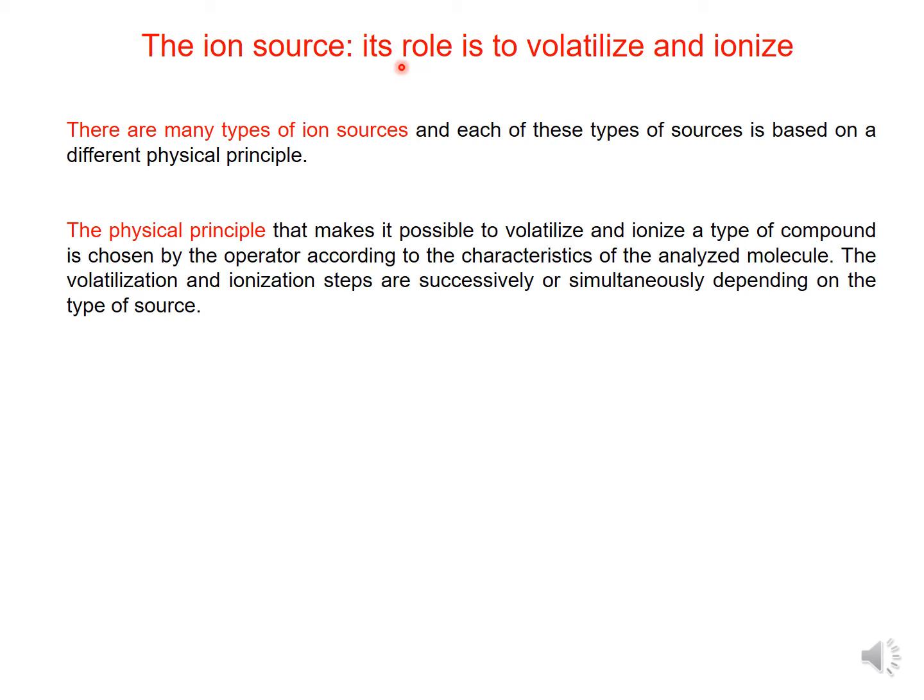And in mass spectrometry, you need to obtain a gaseous ion to perform the measurement of the mass of the molecule.